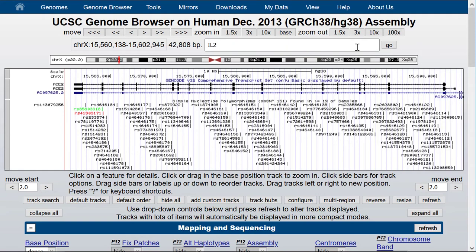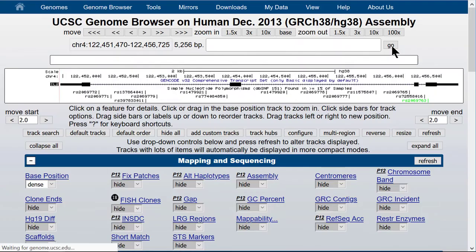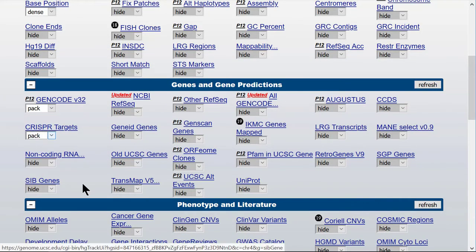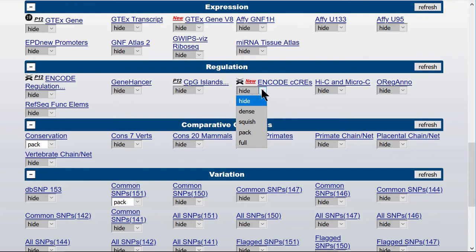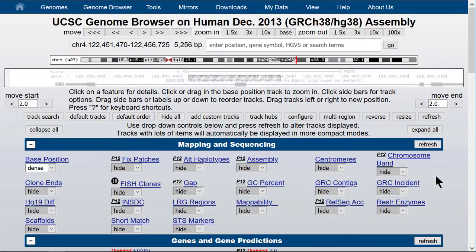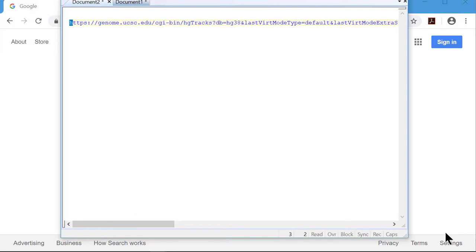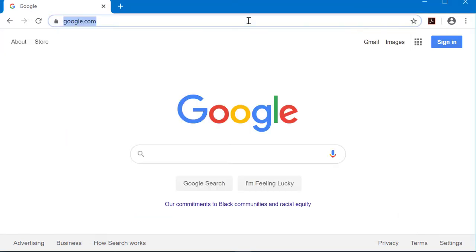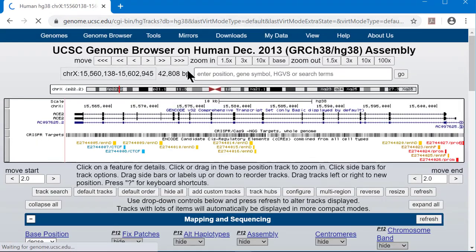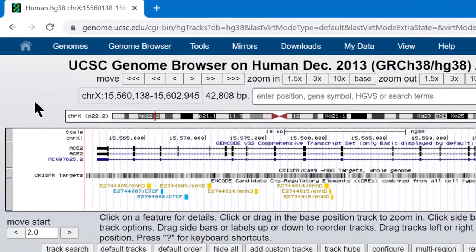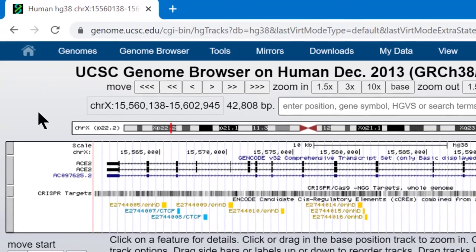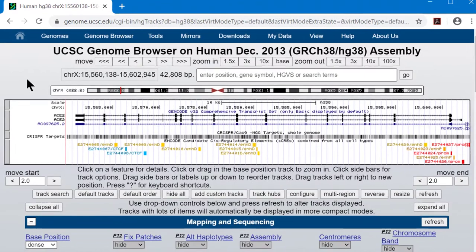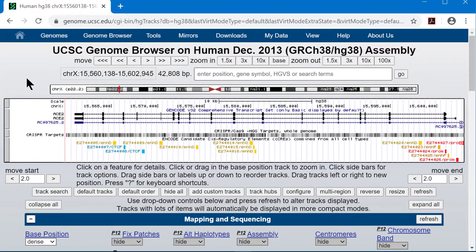Then I get busy looking at other genes — IL-2 maybe — and other data as I turn on the CRISPR guides, and conservation tracks, and the new ENCODE cis-regulatory elements track. I turn off the SNPs. My colleague clicks the link I sent her — I'll switch from Firefox to Chrome to simulate another person — and we both expect that she'll see the ACE2 receptor and the SNPs in the window. No such luck. She's looking at ACE2 alright because the position is encoded in the URL, but the tracks are all wrong. She'll see the tracks that match the cookie, which records what I did after saving and sending the link, not what I wanted to share. The cookie is tracking what I'm doing. The SNPs are gone.